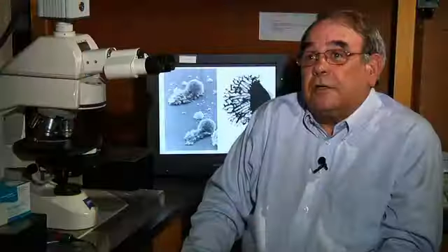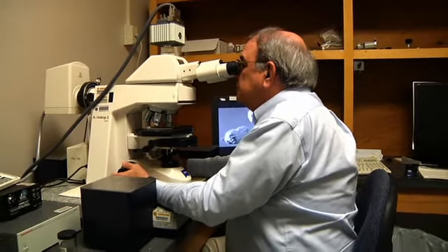My postdoc, Katsuya Shimabukuro, devised a way that he could reconstitute this motility in the test tube or under the microscope. And by watching this reconstituted system and taking it apart in various ways and looking at it with an electron microscope, he was able to figure out a plausible mechanism using this worm sperm experimental system, a plausible mechanism for how to pull the rear of the cell forward without using a motor protein like myosin.